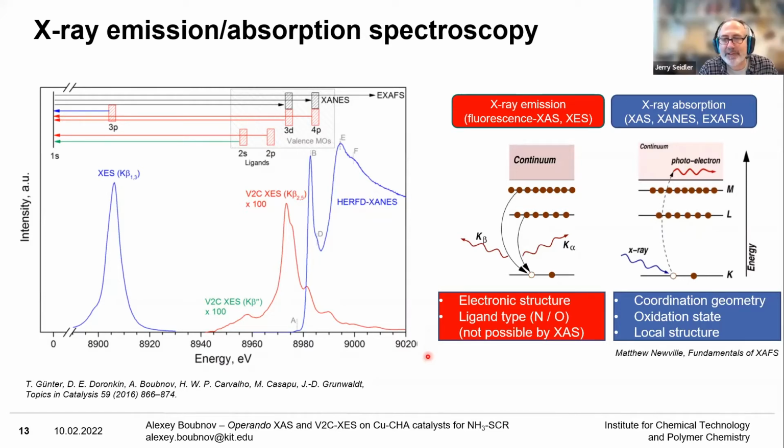Oh, wait a minute. Matthew, do you have a question? Actually, just a suggestion for you, saying that on your point, I was thinking that perhaps the reason you don't see that dip at the B position is that maybe the sample is dilute enough so that the probe depth doesn't change much at B versus A, for instance.